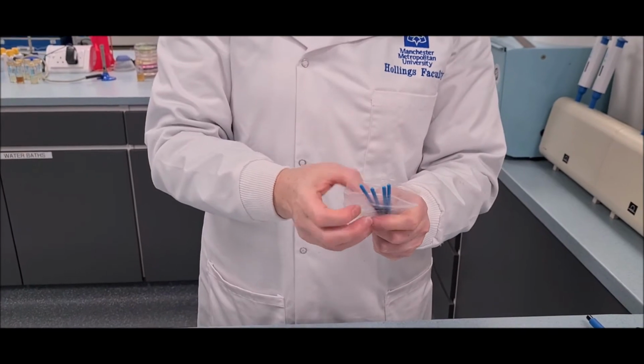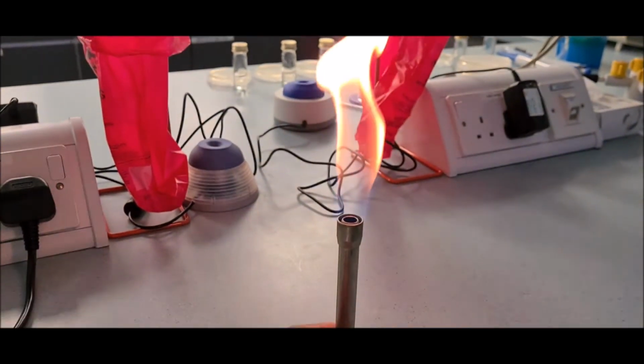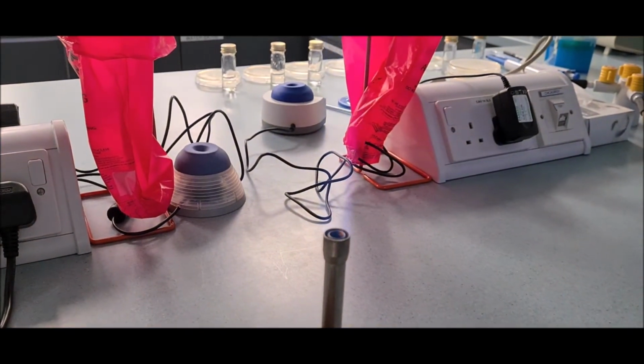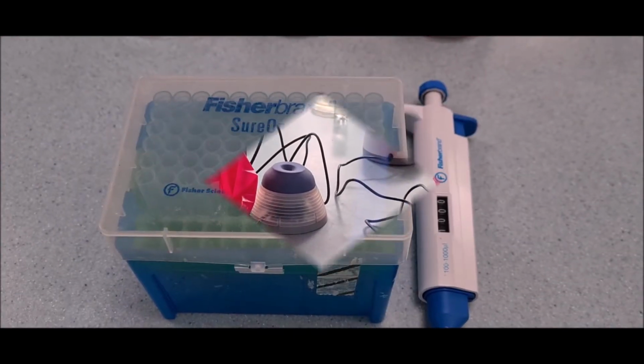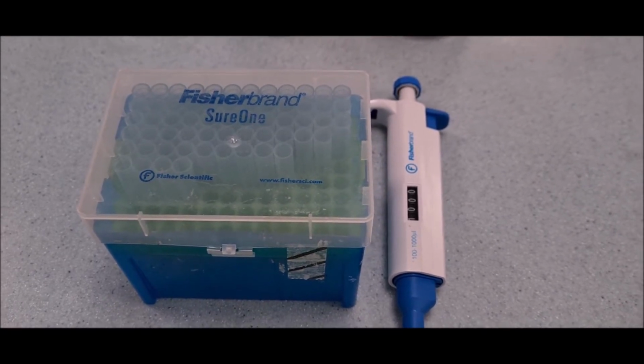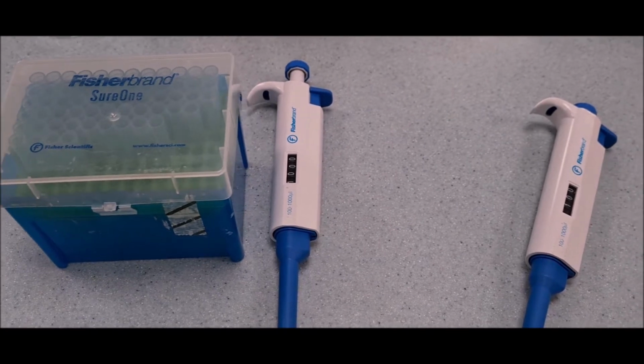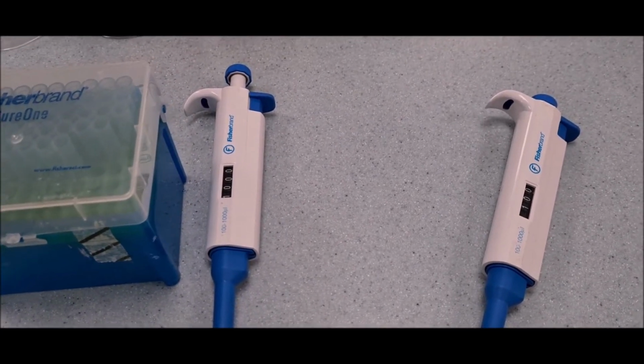Sterile spreaders. Bunsen burner. 1000 microliter micropipette with corresponding pipette tips. 100 microliter micropipette with corresponding pipette tips.